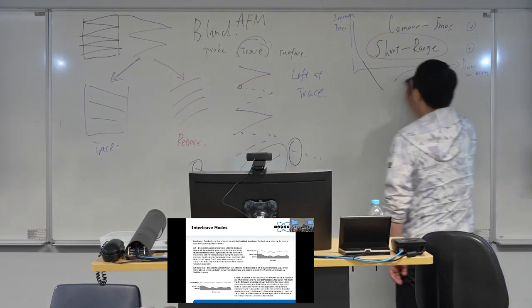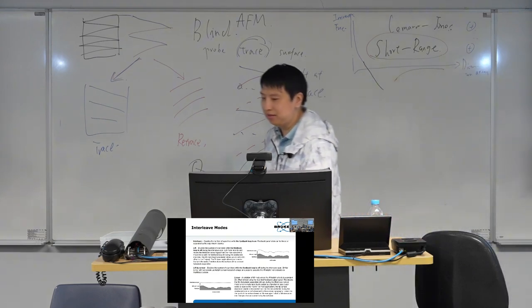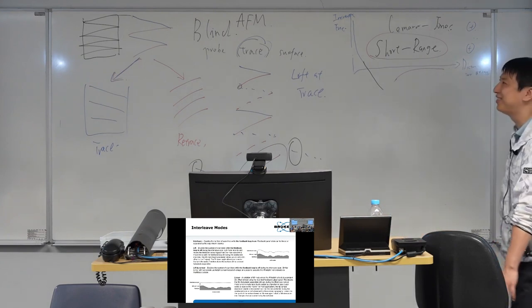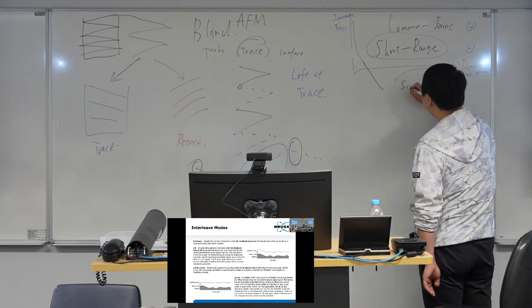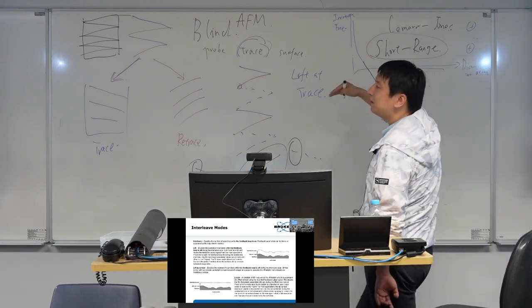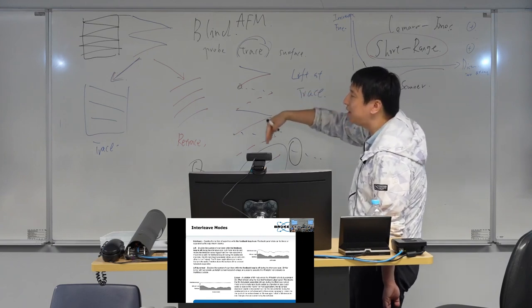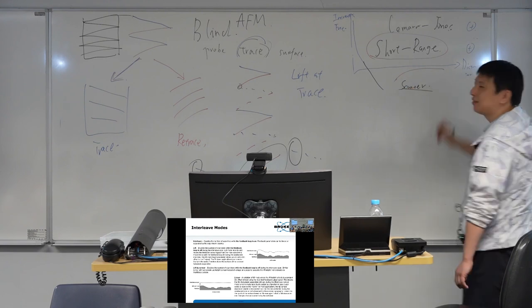That's just some idea about the piezo response tomorrow. So we will give it here. So what's our scanner? We said the probe trace on the surface, and then we use something to drag the tip to scan on the surface. This we call it a scanner.